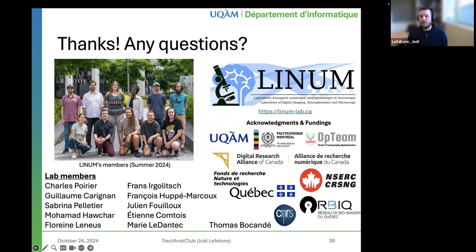So for some systems, if we have the funding, and if we want to reproduce the study, we can build our own system. For others, you can look at the paper, and often in optics, all the materials are listed, even with part numbers and where we bought them. So there's a way of building the system if we want. And other times, you can buy a similar system from different manufacturers. But there's a big push towards open science and reproducibility in optics.